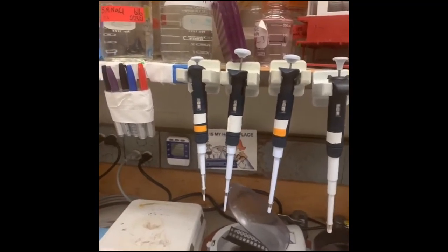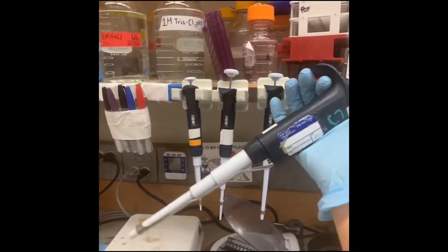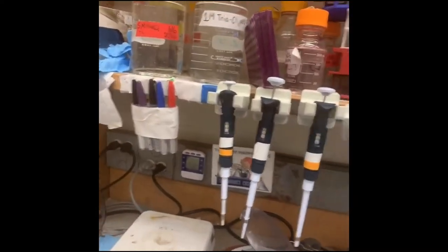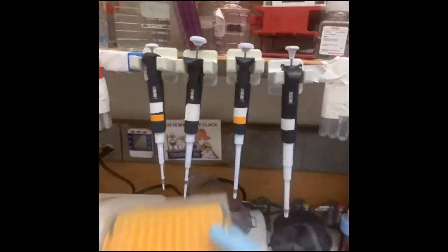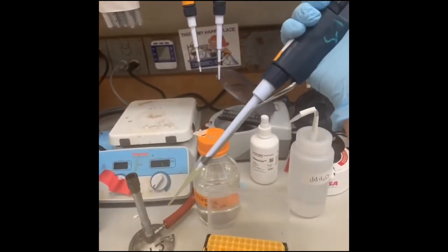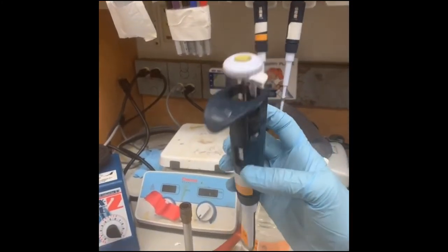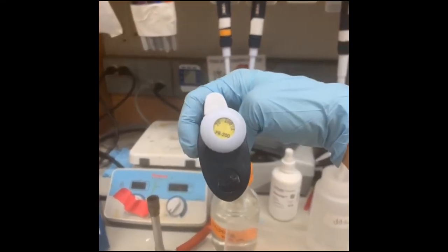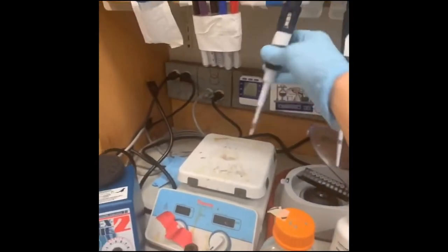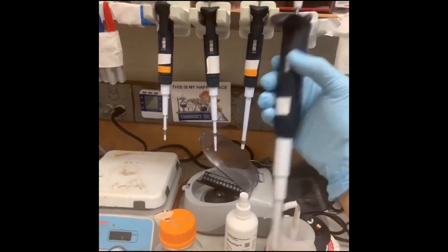Of course one of the most important things are pipettes. In a biochemistry or molecular biology lab you're usually talking about these micropipetters. They come in different sizes for different amounts of liquid and have different tip sizes. We tend to refer to them by their sizes — this one goes from 20 to 200 microliters, we call it a p200. This one goes to 20, we call it a p20. This one goes to 10, a p10, and this one goes to a thousand, a p1000. A thousand microliters is one milliliter.